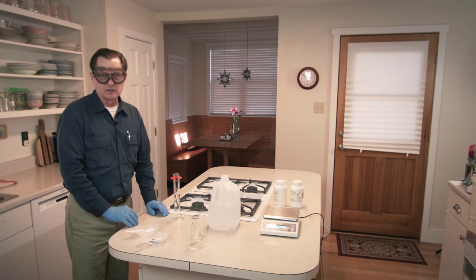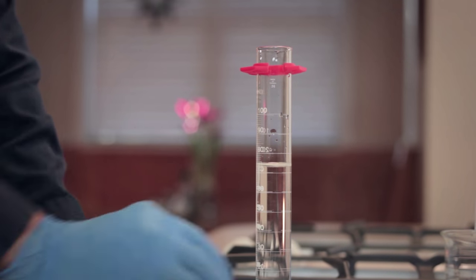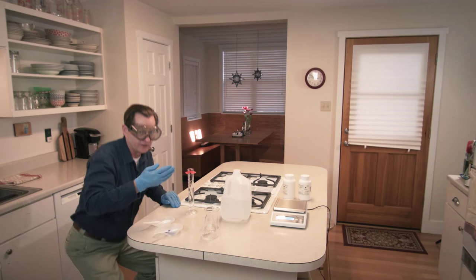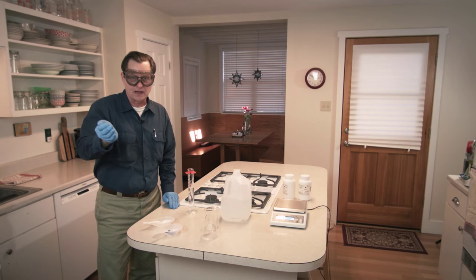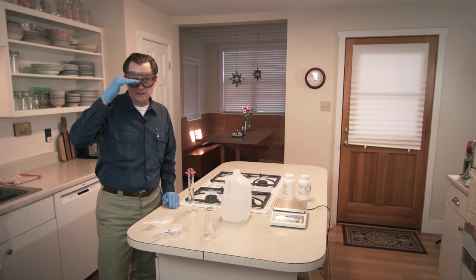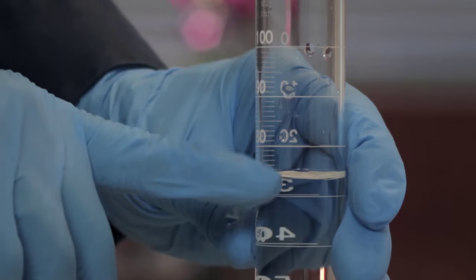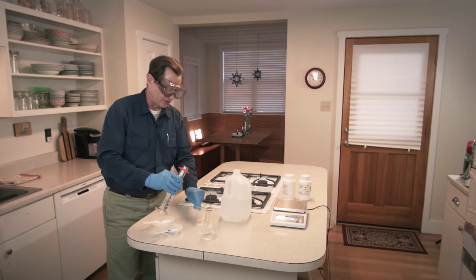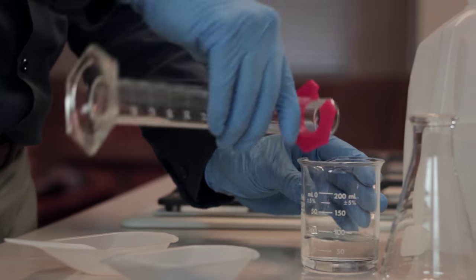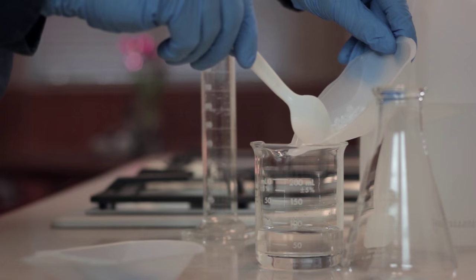This is a good time to inform students the proper way to read a volume on a graduated cylinder. With the cylinder on a level surface, position your eye horizontally at the liquid. Water in a graduated cylinder makes a bowl-shaped surface called a meniscus. The correct way to read the volume is to look horizontally at the bottom of the meniscus. I've got about 73 milliliters, which is fine, so I'm going to transfer this to a 250 milliliter beaker and pour in the sodium hydroxide.